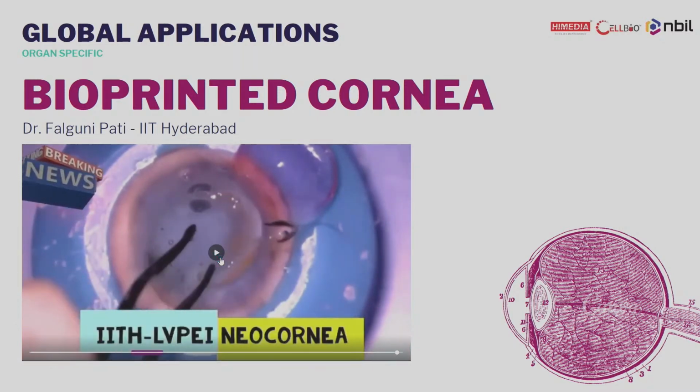So yes, this is the applications and obviously a little bit of the technology. Post this, we would want to show you a demonstration of the machine and also explain what the components in the machine are, what features you can explore, and how you get to print any shape that you would want to print.